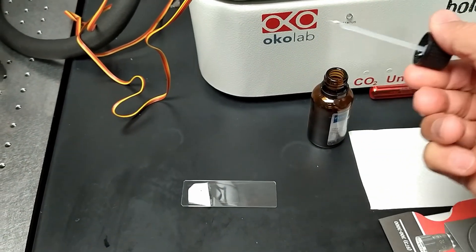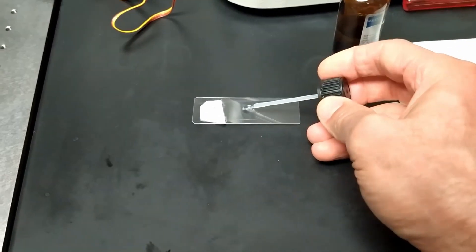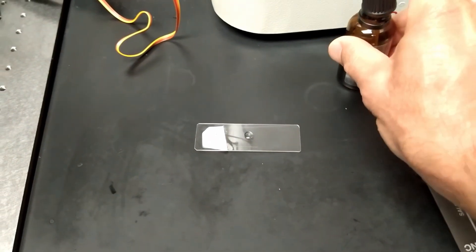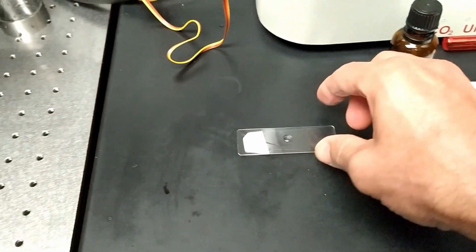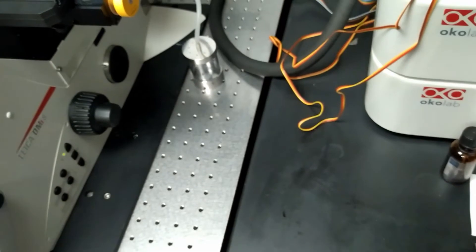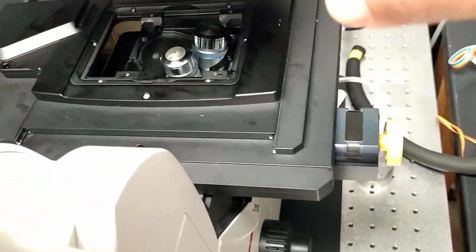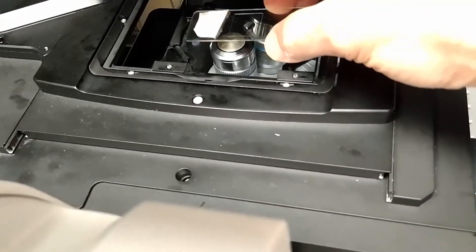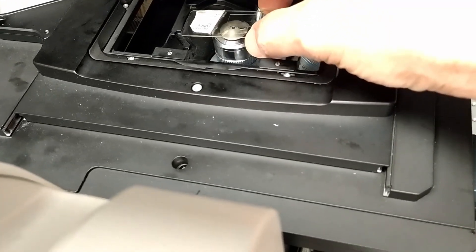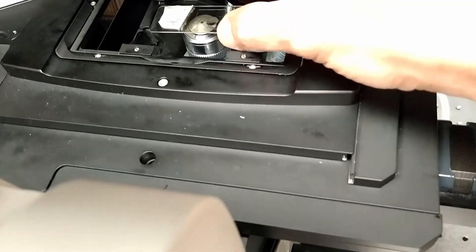Depending on the carrier, you may need to put the oil on the objective as well — for example, for 35mm dishes when doing live cell experiments. Now take the slide and turn it over because it's an inverted microscope. Adjust the holder as needed and carefully place the sample on the holder.